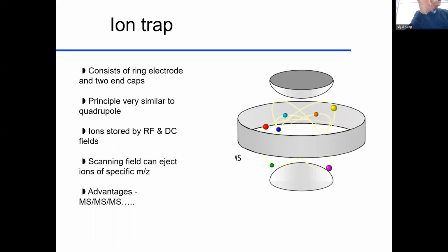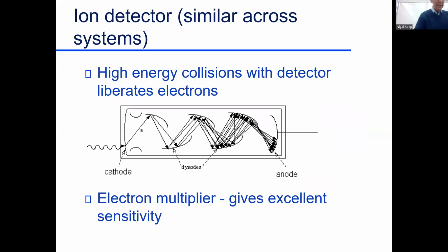Oh, this one I put in terms of magic. How's that? That means I don't have the foggiest idea how it works. But there is a way, apparently, by having the proper charge in the proper places and synchronized charging. So they may be formed, drawn down a tube, but then they're collected, that mass. You can build up a lot of those ions, and then you inject them, and you can get better sensitivity. Because most of them, you've got kind of a flow-through line. And if your concentration is too low, you don't see it. But if you can collect it for a while, then you can get enough to see it. So this technique, an ion trap, is really good for sensitivity. That's its purpose, having sensitivity in your analysis. But how it collects everything over there, like I say, I don't know, the foggiest idea.